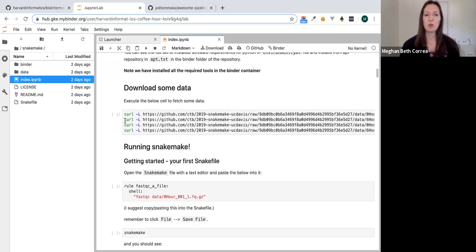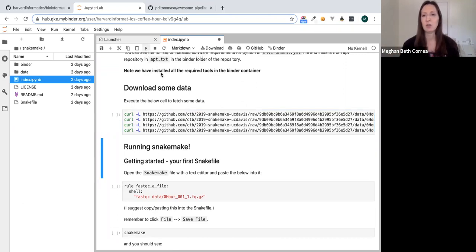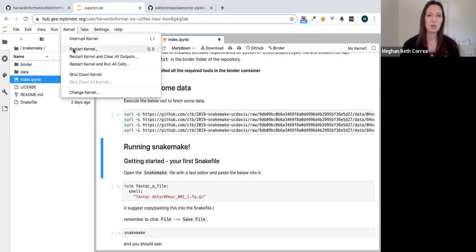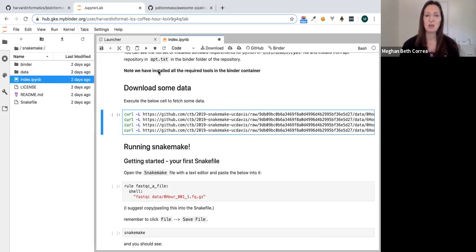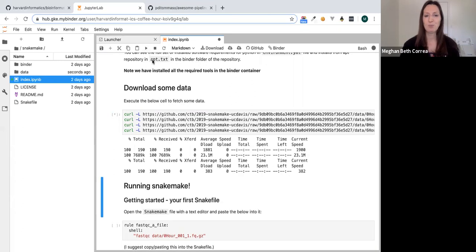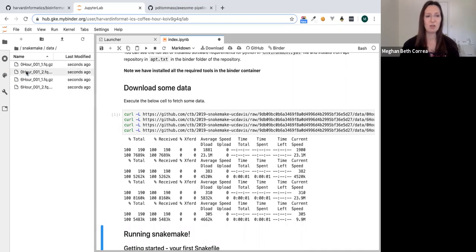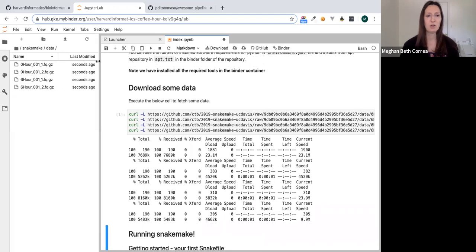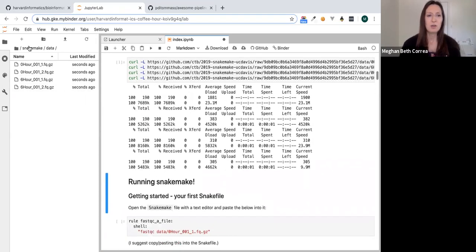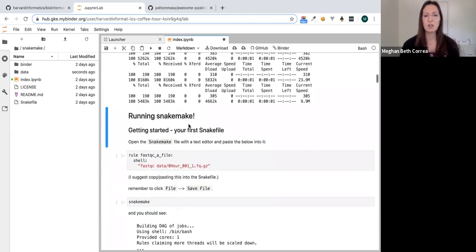The first thing we want to do is download some data. If you're going to follow along, execute this first cell. You might notice if a cell doesn't execute, it could be because your kernel is gone — just restart the kernel. Once executed, it should download some FASTQ data into the data folder, and that's the data we're going to be working with.